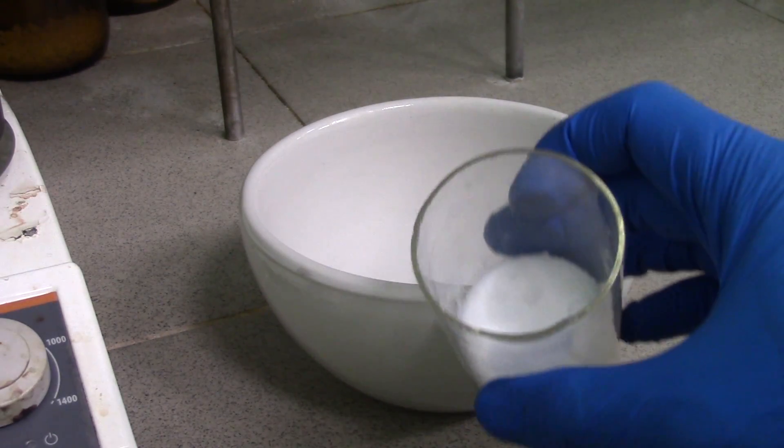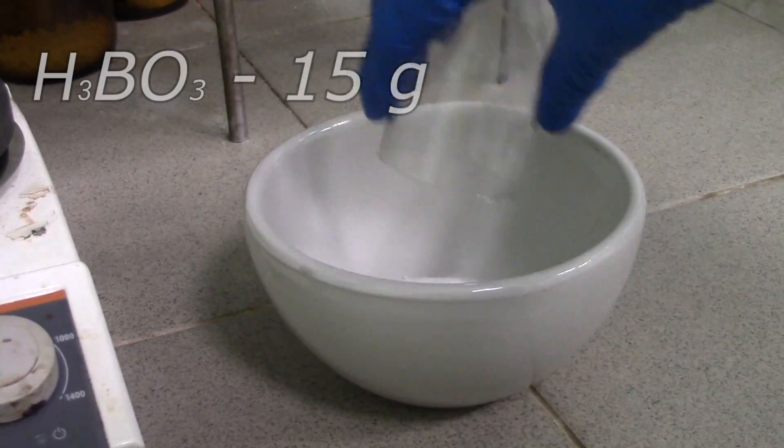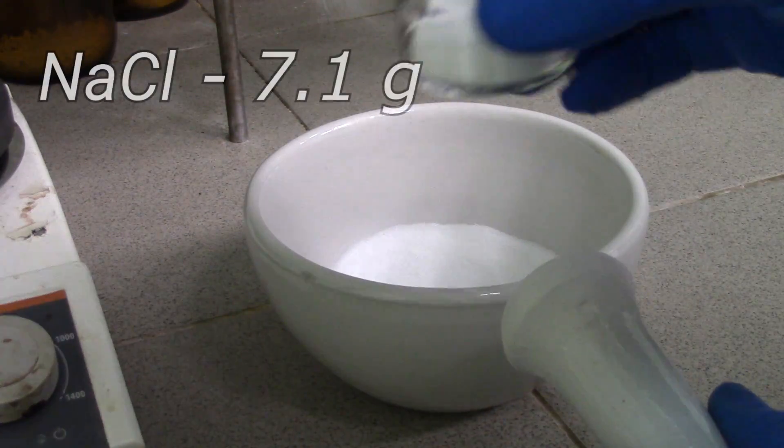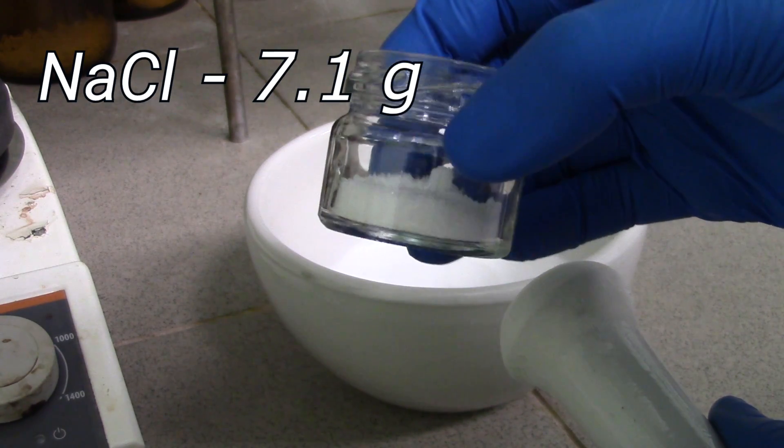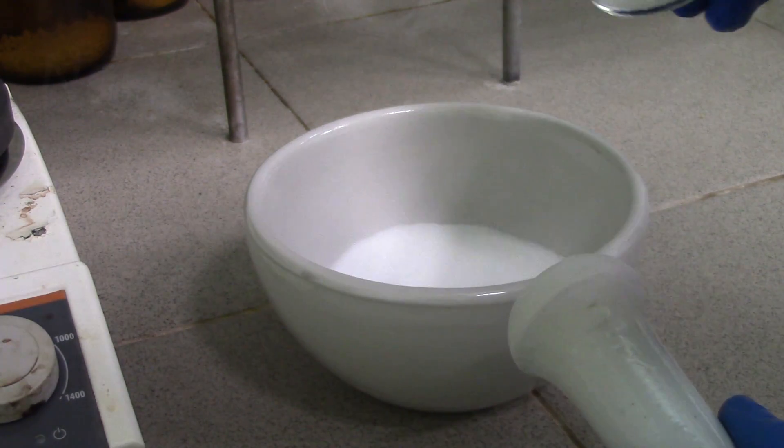For today's experiment, I put in water 15 grams of boric acid and 7.1 grams of table salt, then grind it into fine powder.